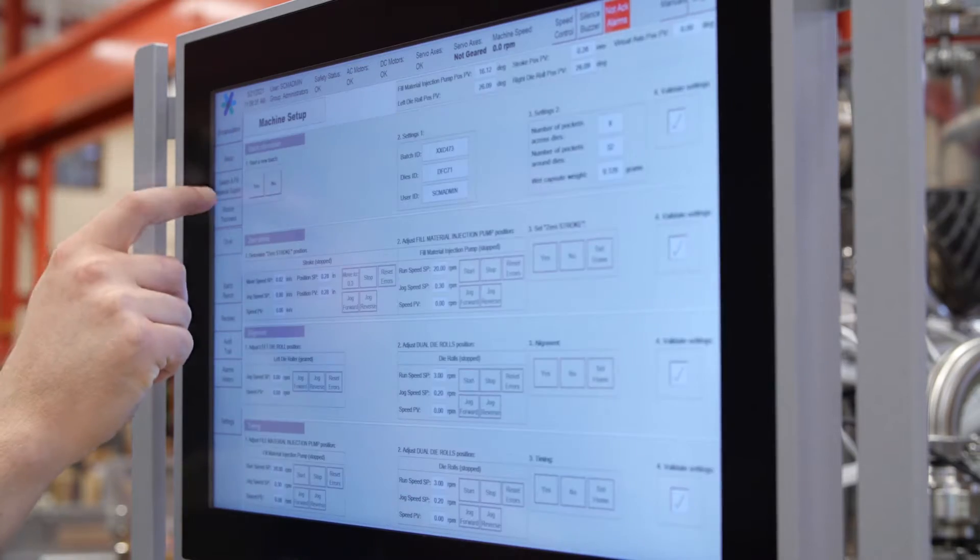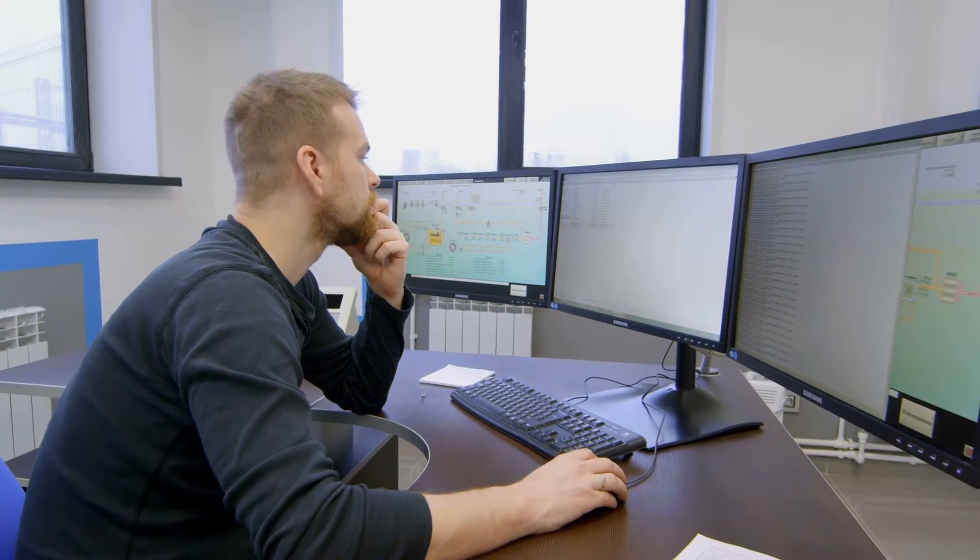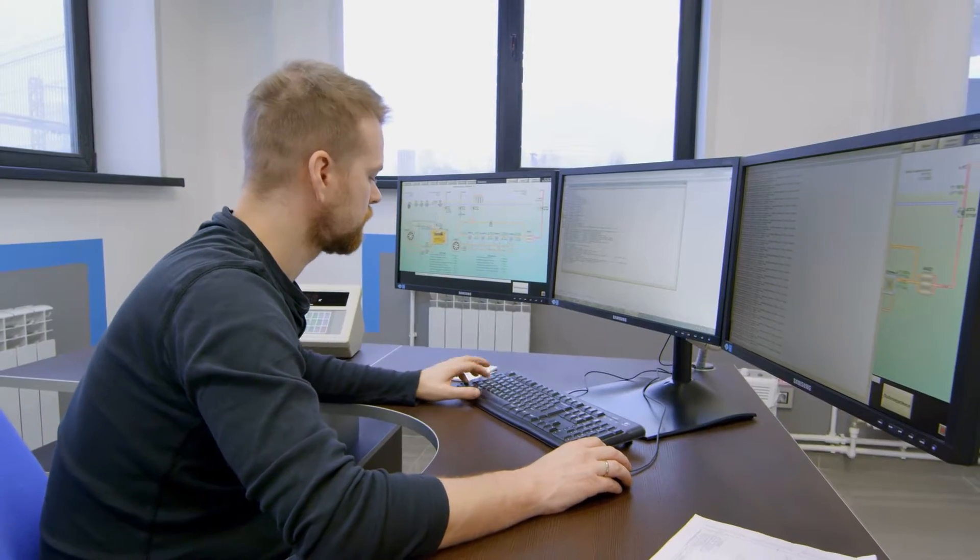Optional data collection to a local PC in the factory to generate reports, so that the end user has the ability to have a proper history of data about each batch.